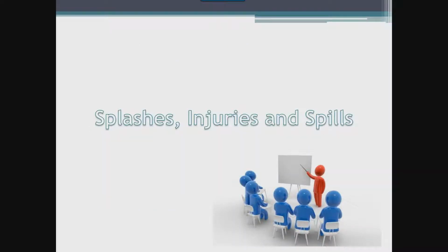Accidents are going to happen, we know that, so we need to prepare ahead of time for these incidents. In the unfortunate event that a spill, splash, or injury occurs due to a chemical, it is important that staff are educated and prepared to act quickly so as to minimize the effect of the exposure. This is why it is so important for staff to be aware of the hazards they are dealing with, because in an emergency, you do not always have the time to pull out your available resources to figure out what to do. These should be automatic reactions so that action can be taken as quickly as possible.